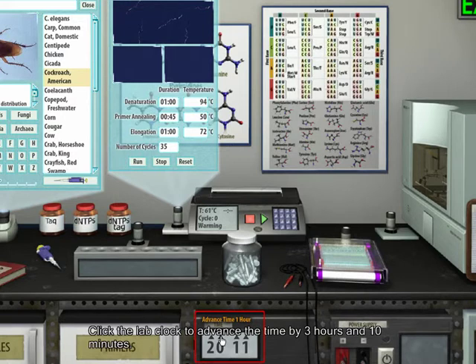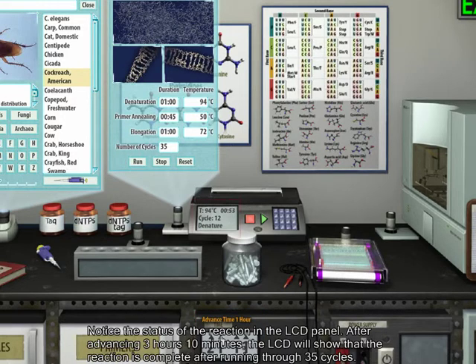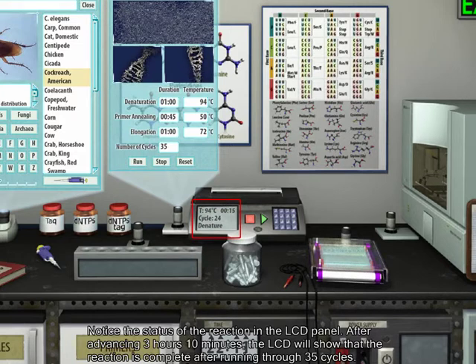Click the lab clock to advance the time by 3 hours and 10 minutes. Notice the status of the reaction in the LCD panel. After advancing 3 hours 10 minutes, the LCD will show that the reaction is complete after running through 35 cycles.